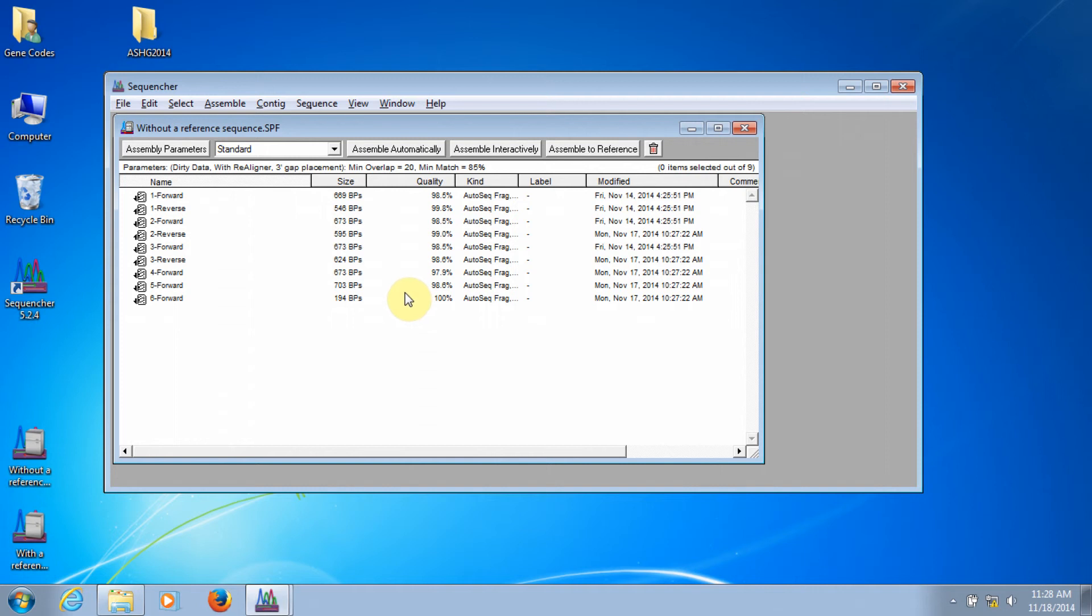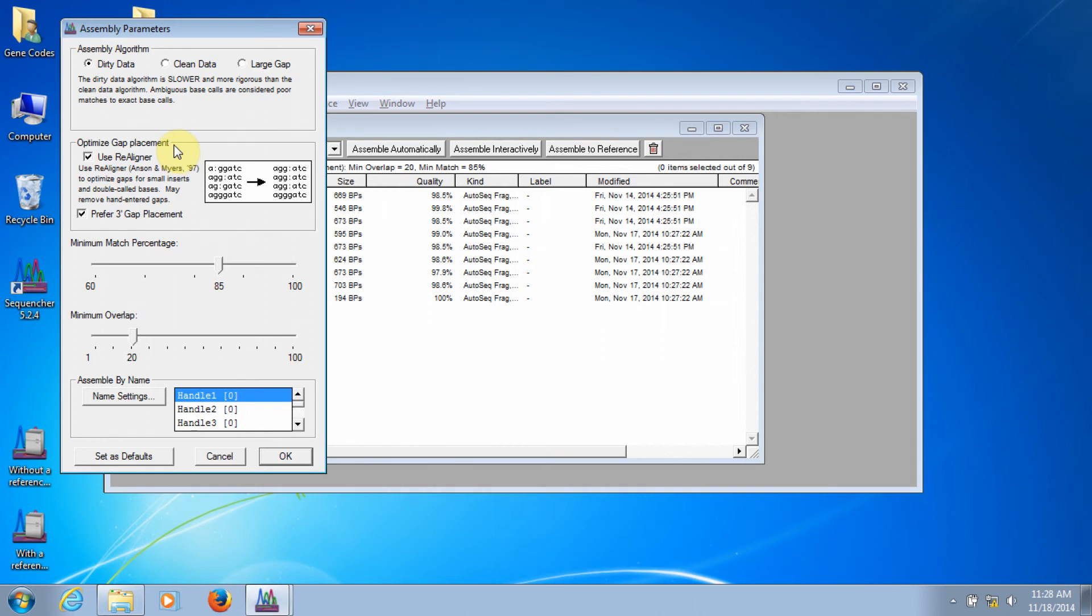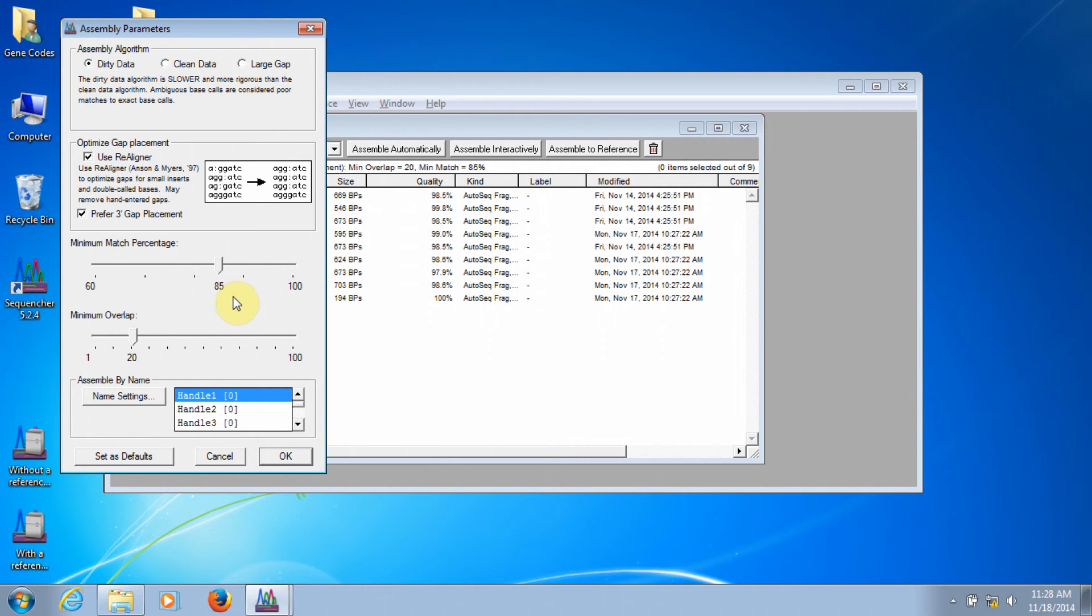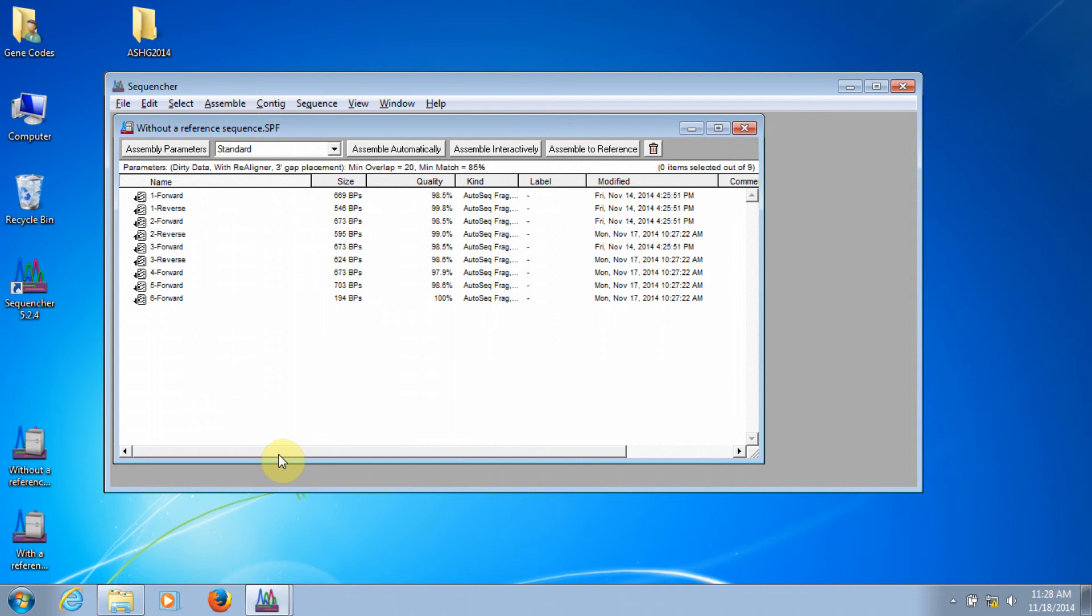The first thing we want to do is click on the assembly parameters button, which brings up the assembly parameters window. Here, you can see that I've chosen the dirty data algorithm to optimize gap placement using realigner and preferring 3' gap placement, a minimum match percentage of 85%, and a minimum overlap of 20 bases. I'll click OK.